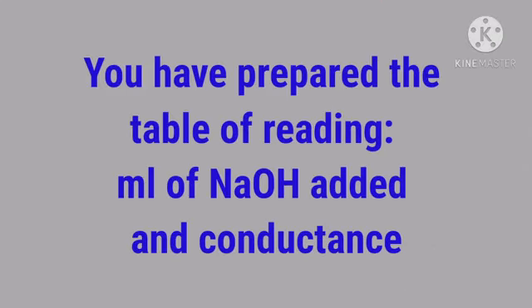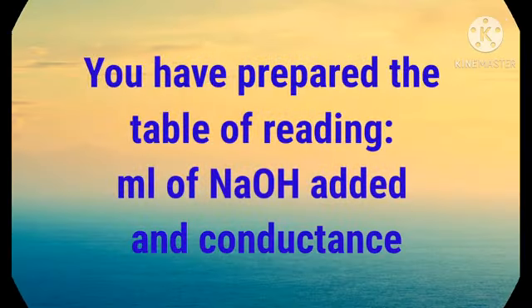As per the instructions given, you have prepared the table of conductance against ml of NaOH. Now plot the graph as explained earlier, find out the end point of the titration and calculate the molarity and the strength of acetic acid.